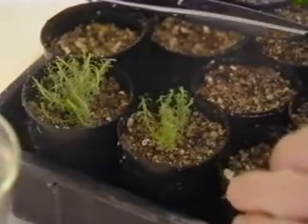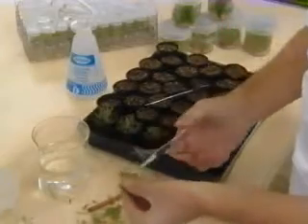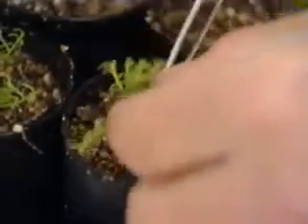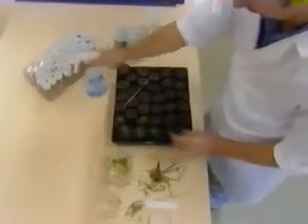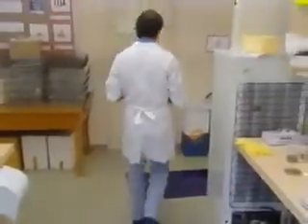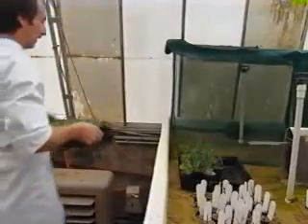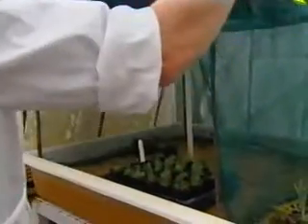The potting mix may be a mixture of sand, peat, and vermiculite. No fertilizer is added to the pots at this stage. At all times, desiccation must be avoided, and that can be achieved by frequent water spray on the plants. Initially, plantlets should be protected from desiccation by placing them in a glasshouse with reduced light and high humidity. This may be achieved by use of foggers or misters, or use of wet tents.